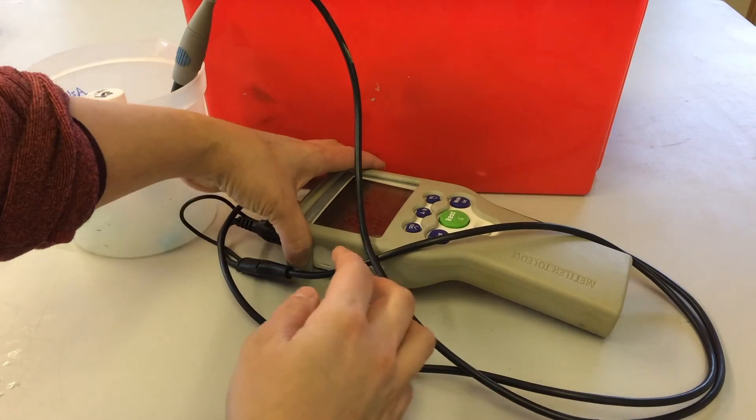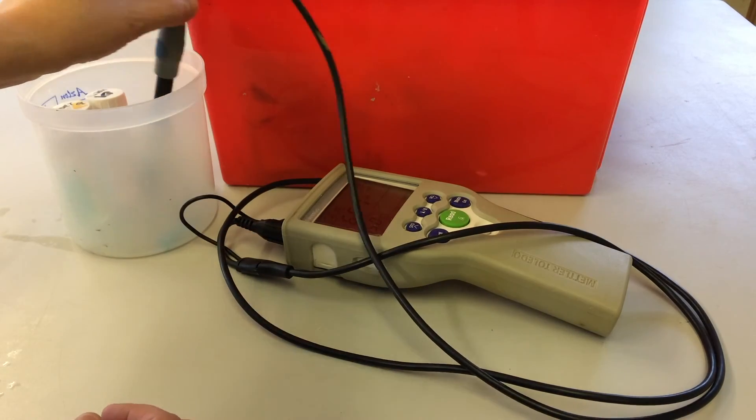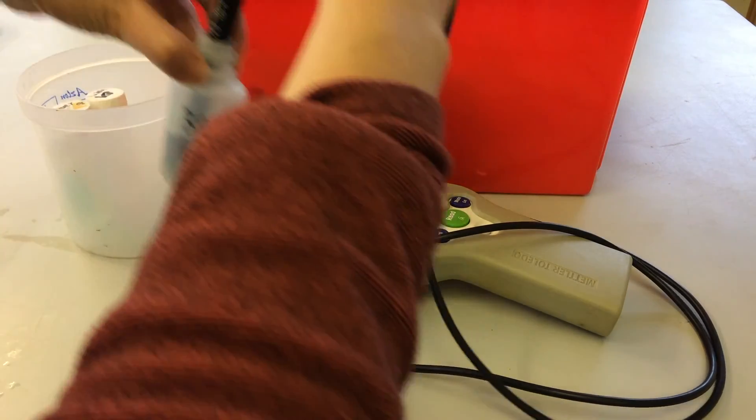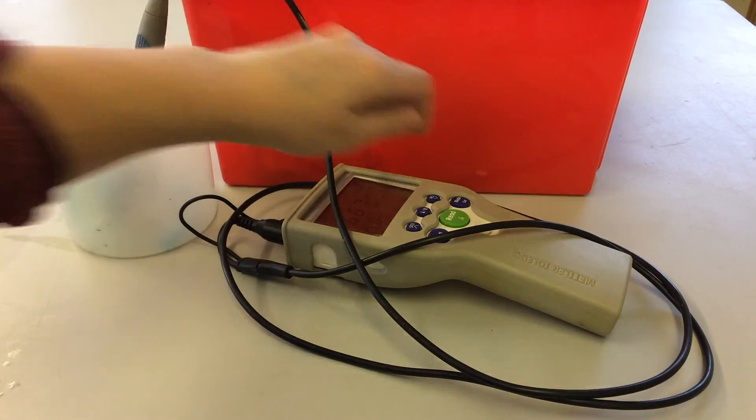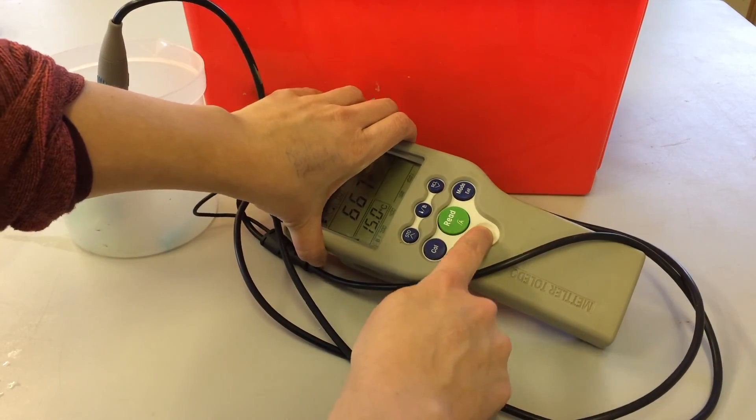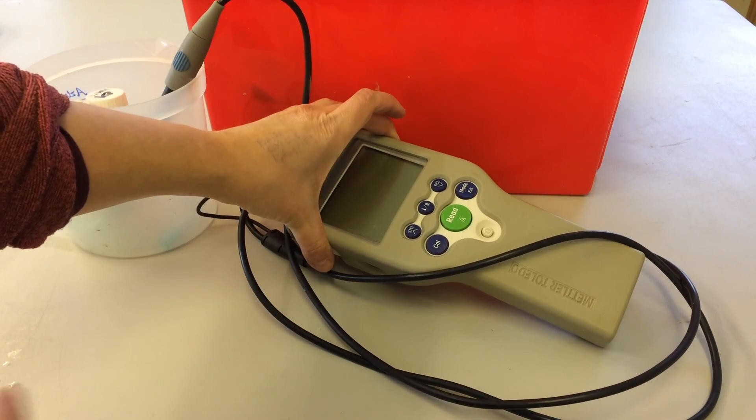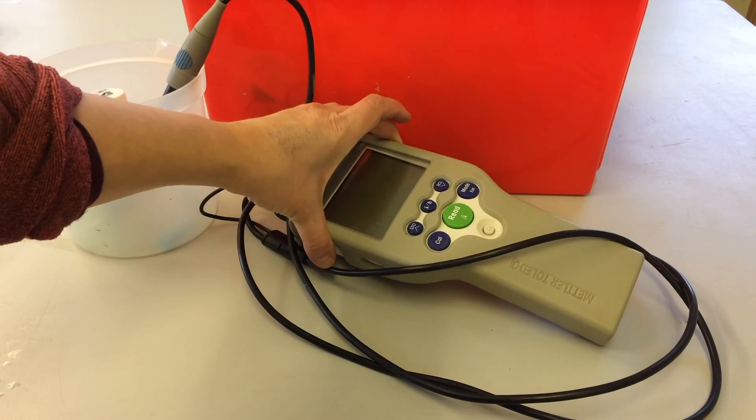And before you store it away, remember to make sure the probe is back in its three molar potassium chloride storage solution so it keeps nice and clean and moist. And turn the pH meter off by pressing the power button just once.